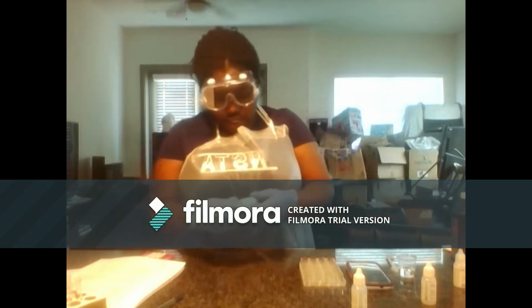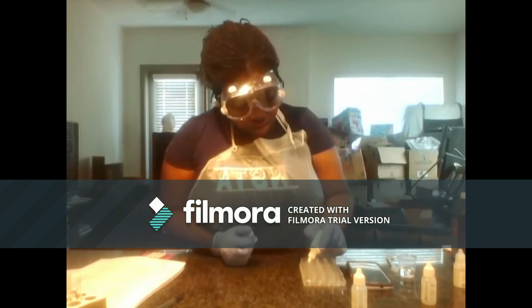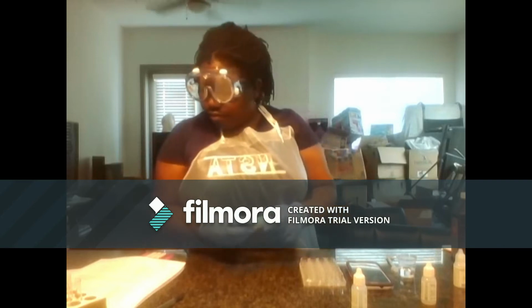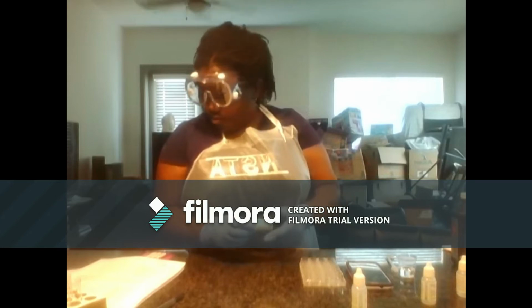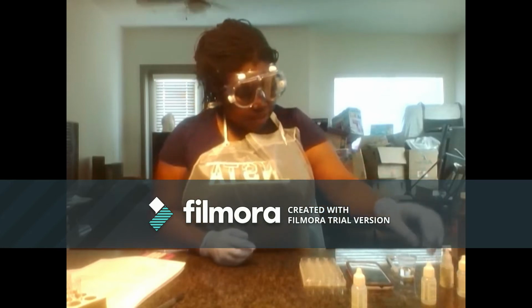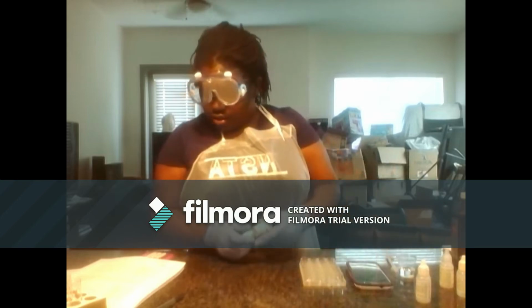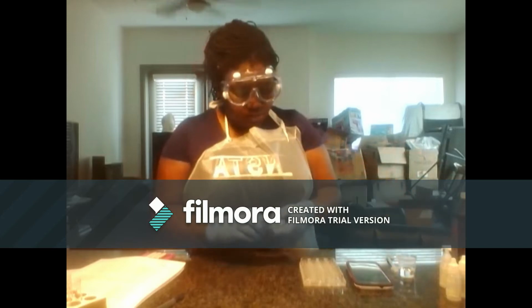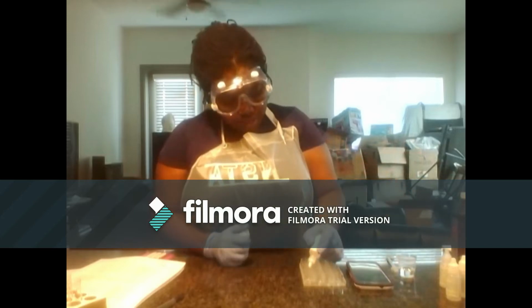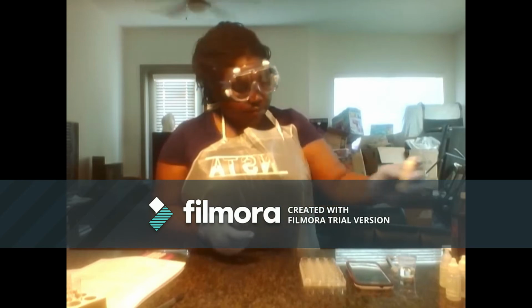It'll be 6 drops of potassium iodide, 2 drops of hydrochloric acid, 4 drops of starch solution, eight drops of sodium thiosulfate, two drops of water.